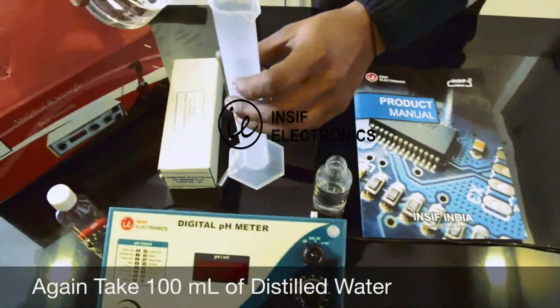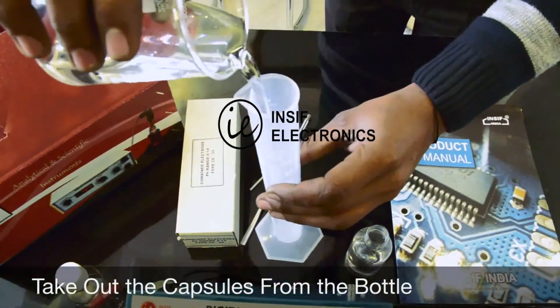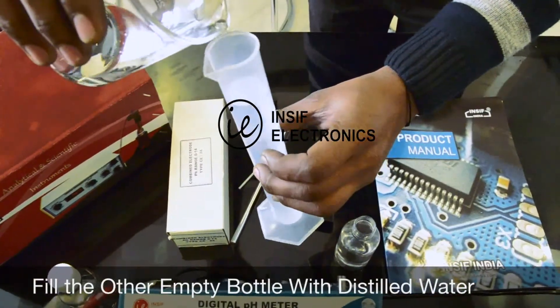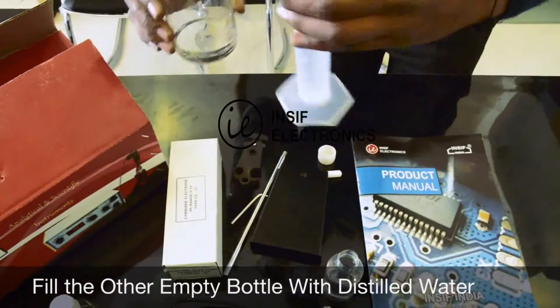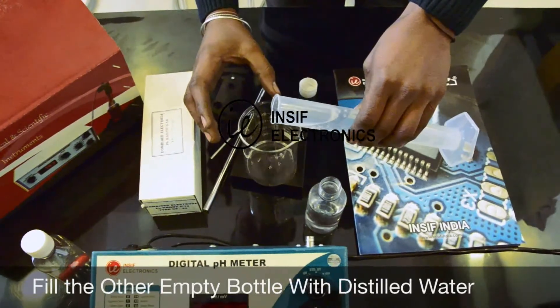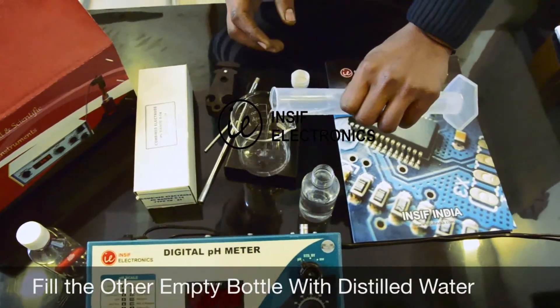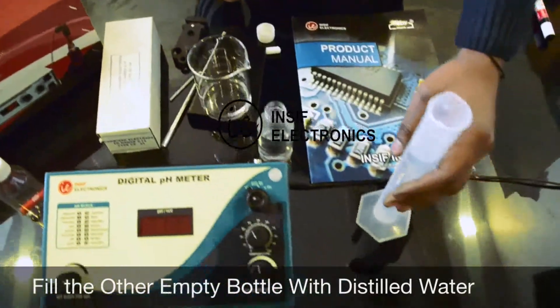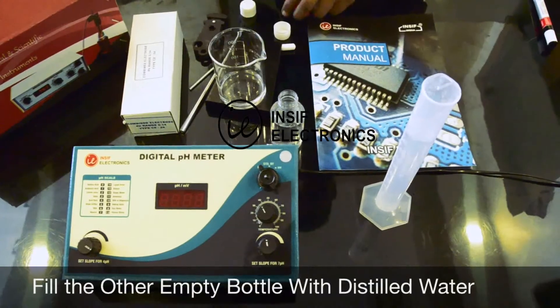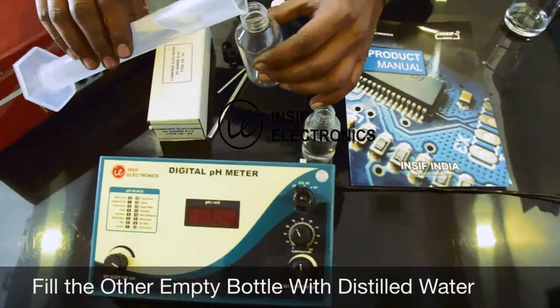Again, take 100 milliliters of distilled water, measure it by measuring cylinder, and take out the capsule. We got more than 100 milliliters, so we are putting it back and measuring to exact 100 milliliters. Now take out the capsule from the other bottle and fill it with 100 milliliters of distilled water.